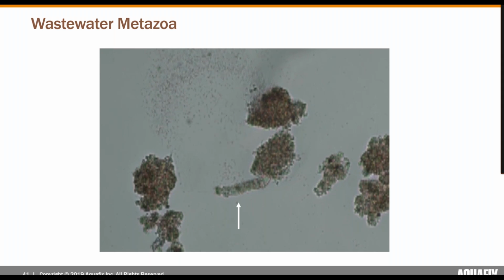And so what I have here is a video of a rotifer that's using its cilia to create a whirlpool and really filter feed on the free bacteria and dead organic matter within the bulk liquid, as you can see here, as this rotifer is creating that funneled whirlpool motion and filter feeding there. Just an interesting look at the active feeding process.